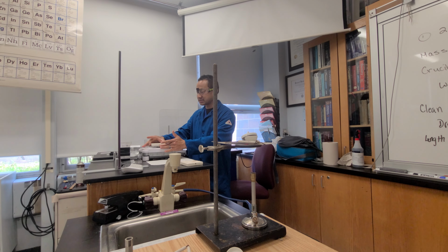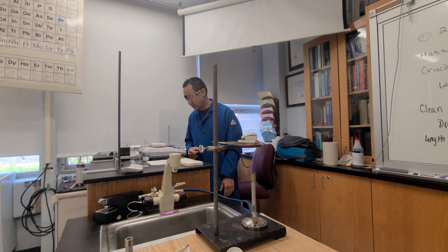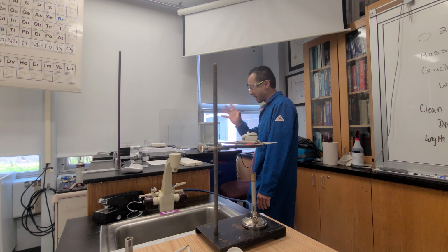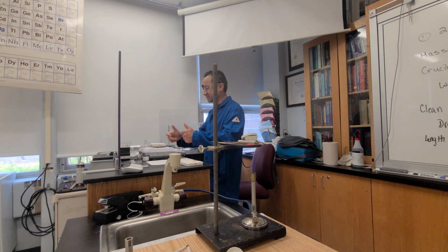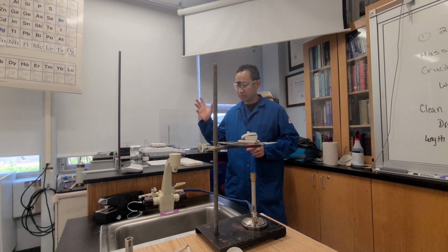So what I do is I take this plate, drop it right down on here, okay? You guys are going to yell at me. If you're watching this, you'll probably put a lot of comments down here about this. I find that this is perfectly fine. This is heat resistant enough, and it has enough heat capacity for the general measurements that I'm going to be doing, okay? I'm going to bring this just a wee bit closer, okay? That just minimizes the distance that I have to travel.